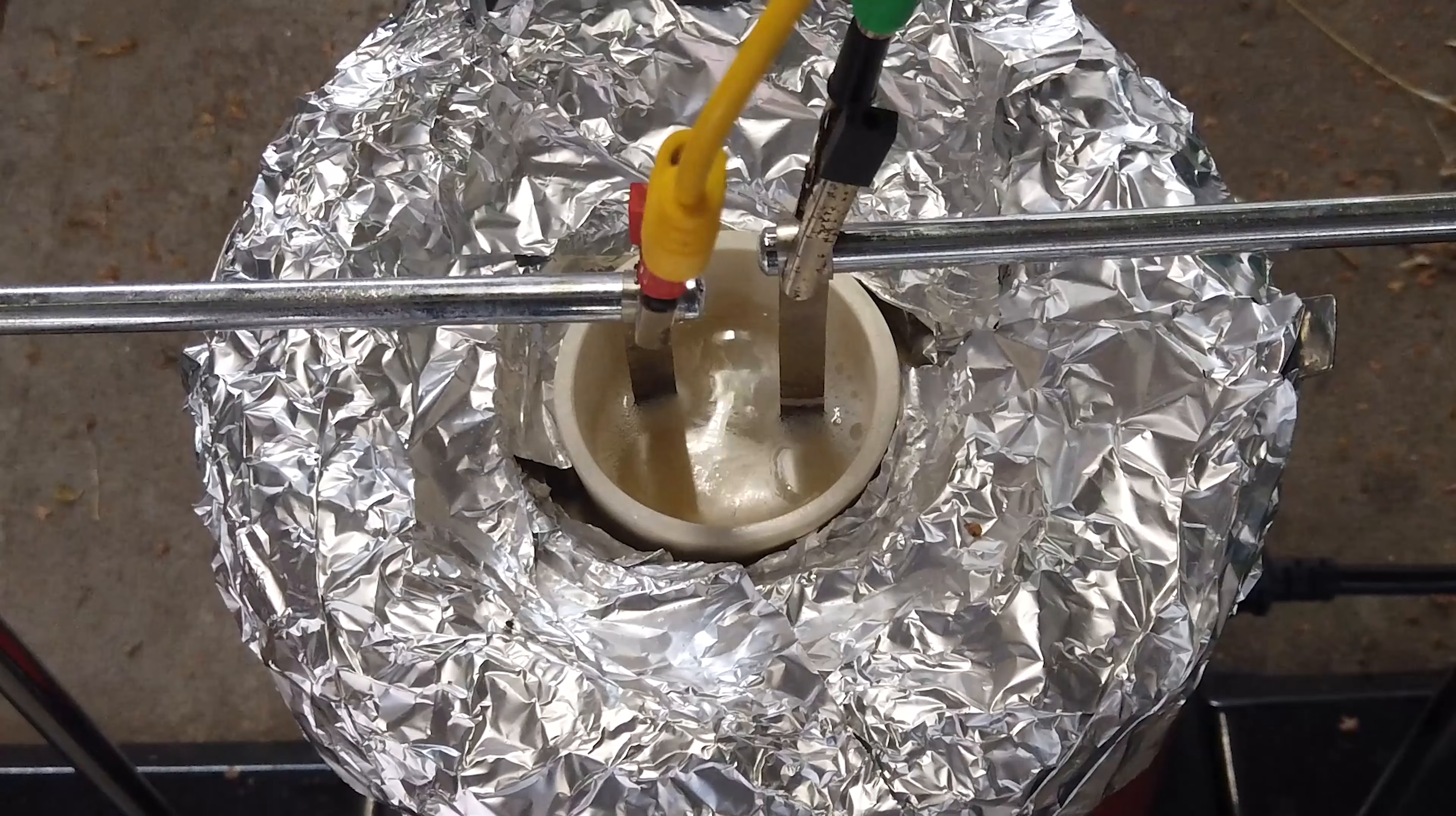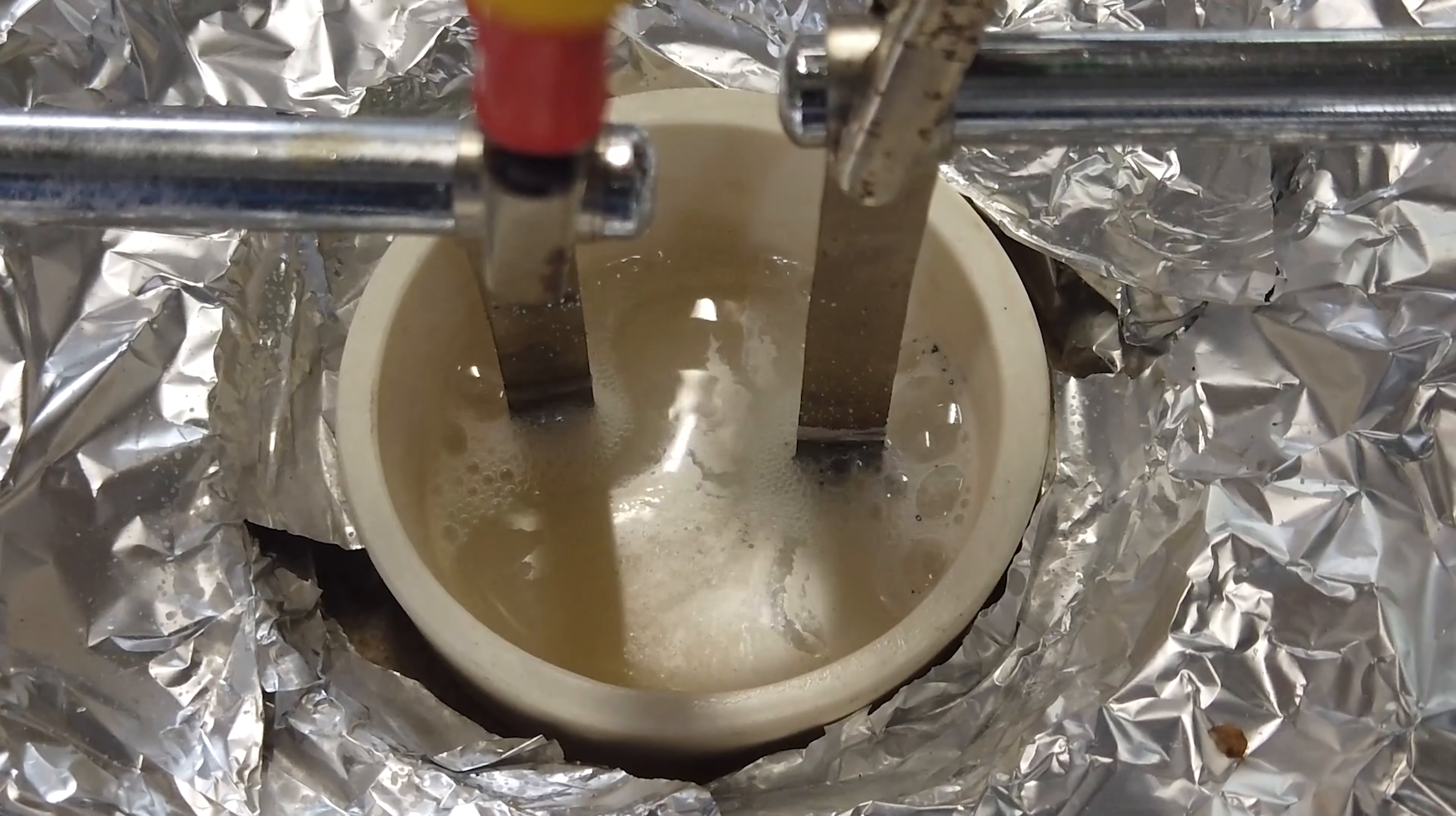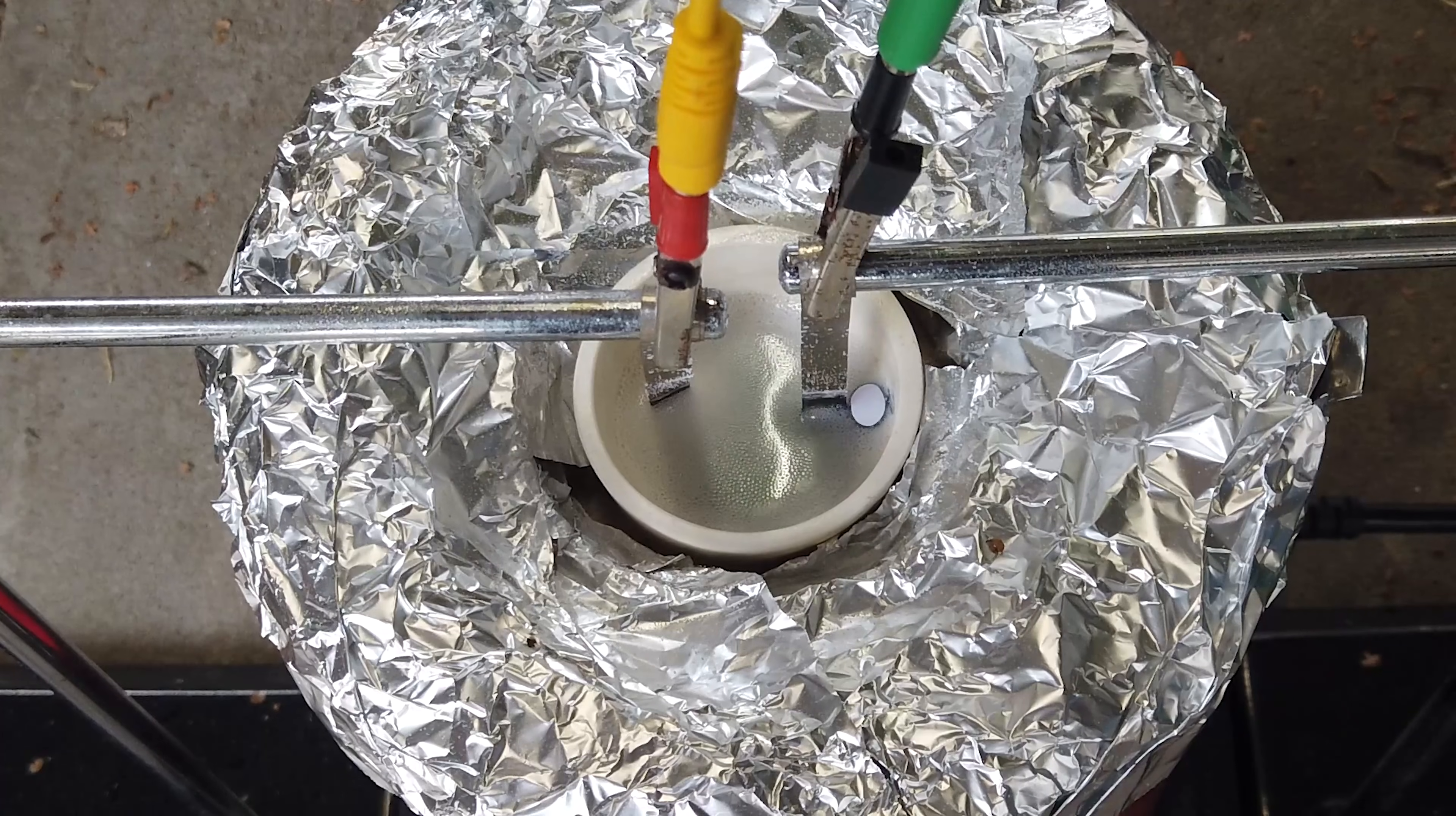These are nickel electrodes, supposedly inert to the electrolysis of sodium hydroxide, anode on the left, cathode on the right. I'm going to turn that off and get that bead of sodium out.